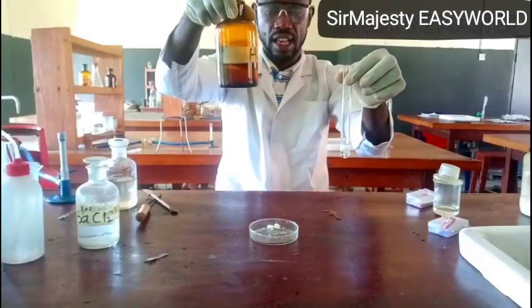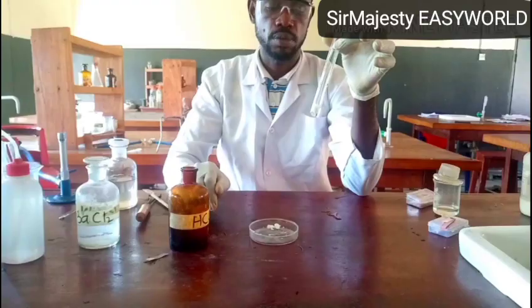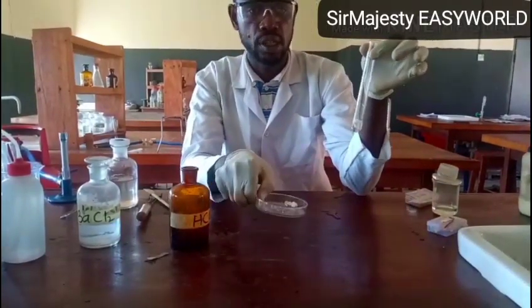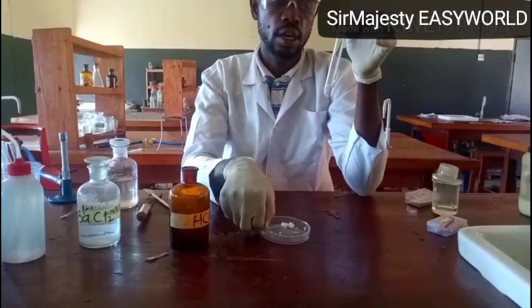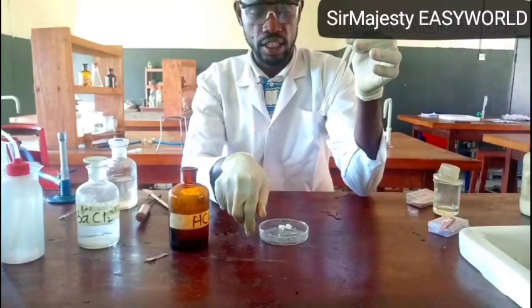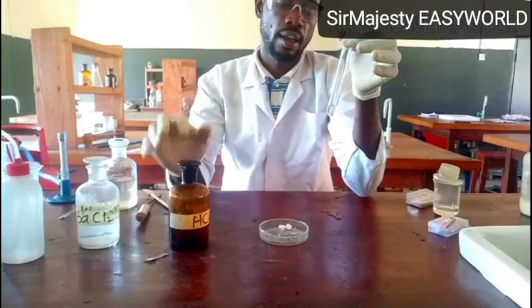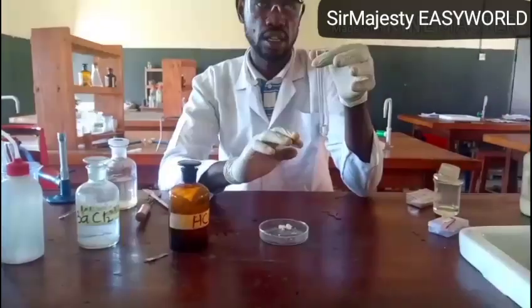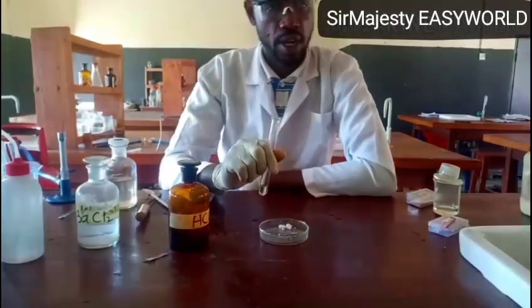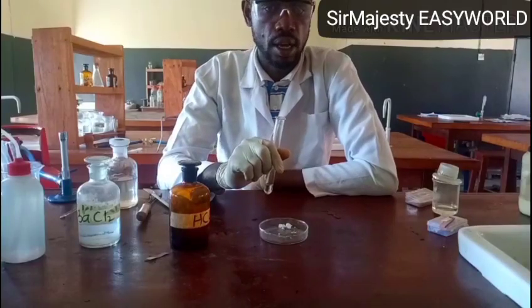And since I know that this is an acid, what causes effervescence with acid is actually something that contains trioxocarbonate 4. So it confirms that this sample contains trioxocarbonate 4 ion, and by so doing, don't just conclude that it contains carbonate 4, but in your observation you just say, on adding dilute HCl, there is effervescence, colorless, odorless gas evolved, which turns lime water milky. You watch one of my videos here in this channel where I show you the test for carbon 4 oxide, and you see how it turns lime water milky.